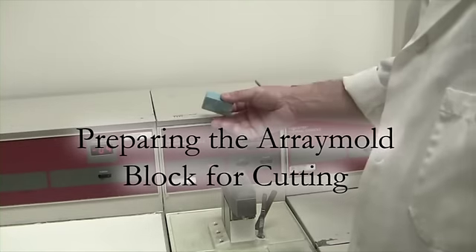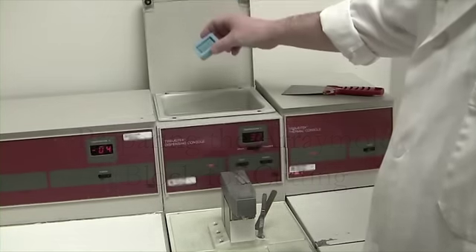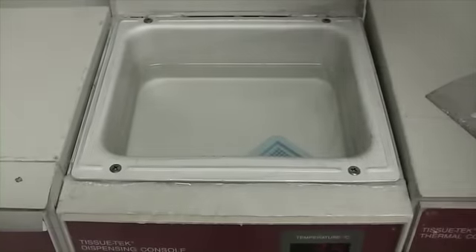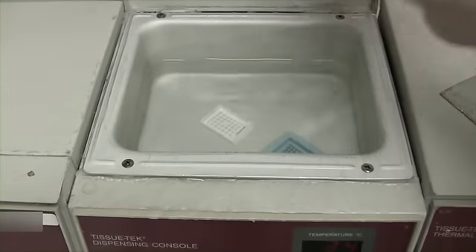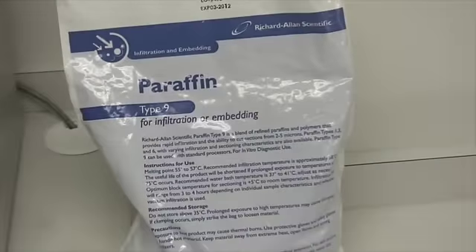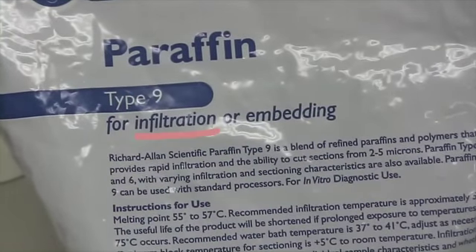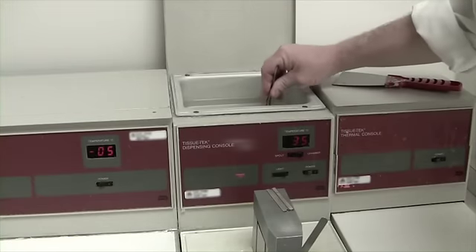I'm preparing your tissue microarray block for cutting. Once your array mold is warmed up in a paraffin bath, place it in an ice plate or an ice tray and add the cassette. Always use infiltration embedding type paraffin. When people ask me what's the best brand, I always tell them to use what they're used to cutting with. Since cutting is the most important part of TMA construction, getting a good section is most critical.